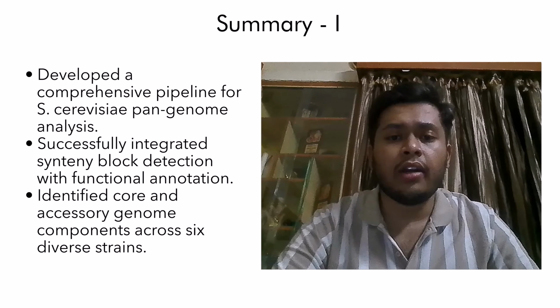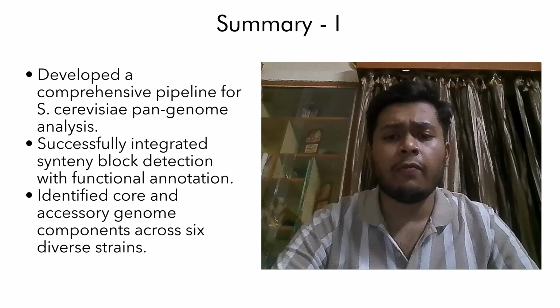We have also detected conserved synteny blocks and their associated functions, providing insights into the relationship between genome organization and function. The conservation of gene order in these blocks suggests functional constraints that have maintained synteny over evolutionary time. Our approach has revealed interesting patterns of genome conservation and functional distribution that contribute to our understanding of yeast evolution and adaptation.